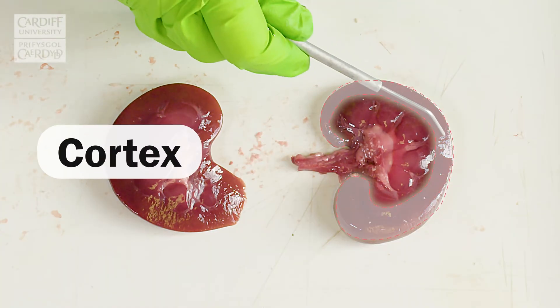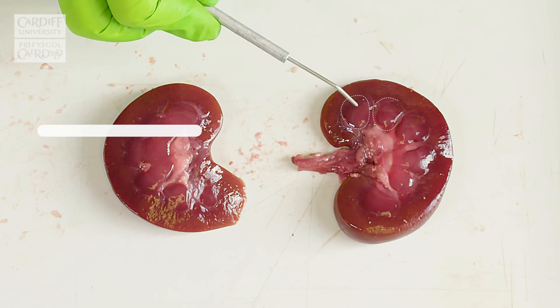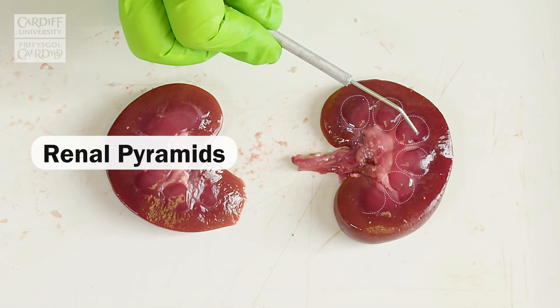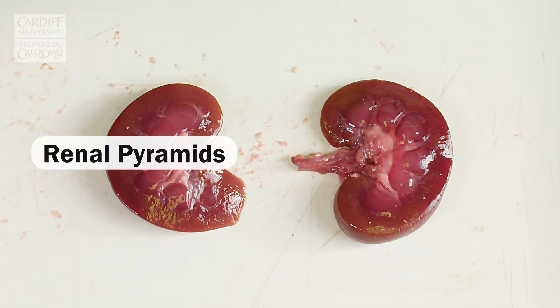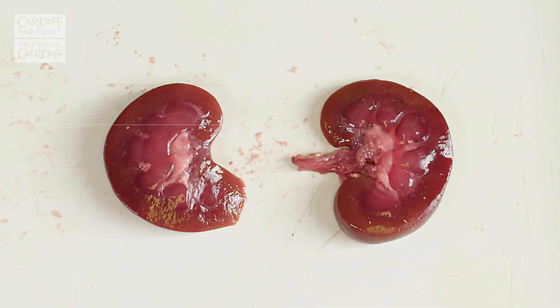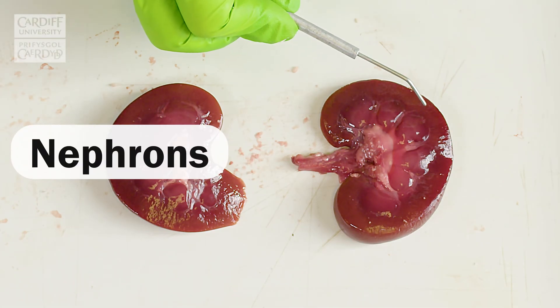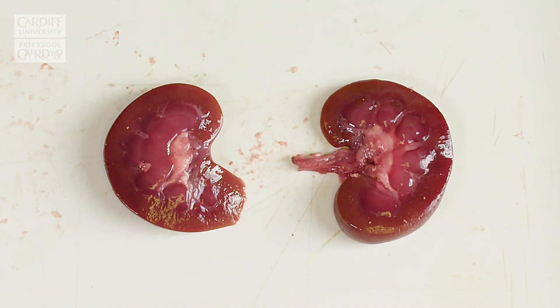Here we have the outer region of the kidney, which is called the cortex. And then here we have renal pyramids, and collectively the renal pyramids make up the medulla. Although not visible, the nephrons traverse both the medulla and the cortex, which are the filtration units of the kidney.